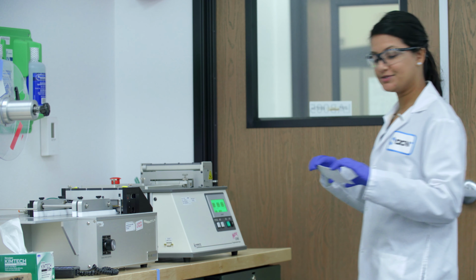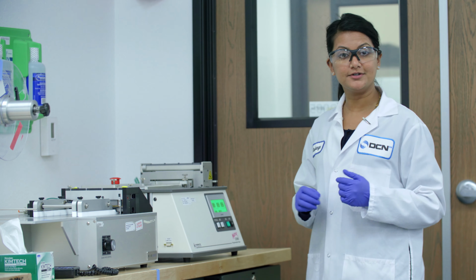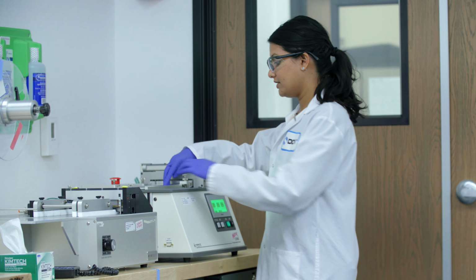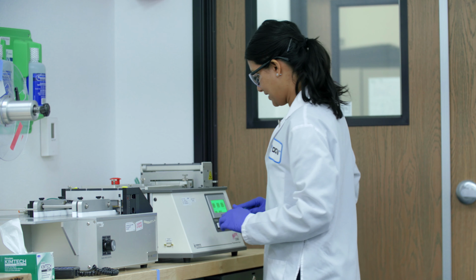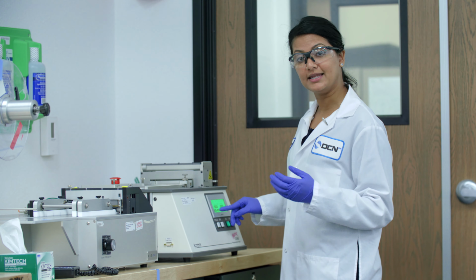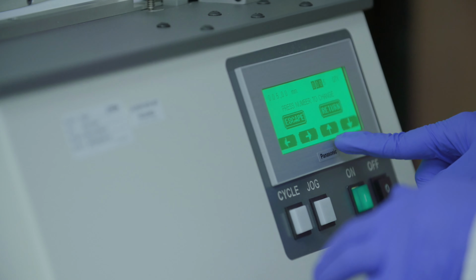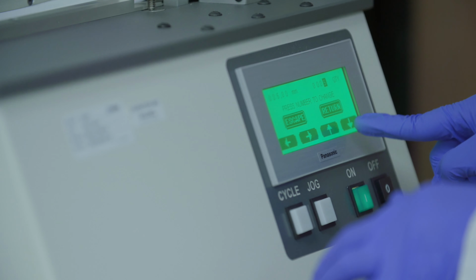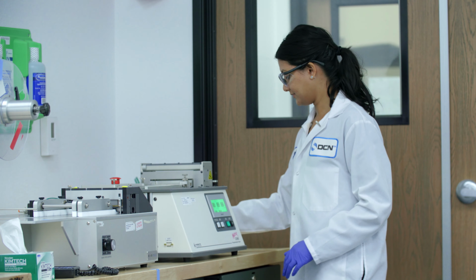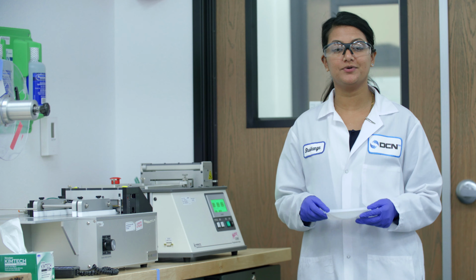Now that we have our assembled strip, now it's time to cut them to our final strip. So we're just gonna load the card here and then adjust our width and how many strips we'll cut at a time. And now we have our final strip ready to put into a cassette.